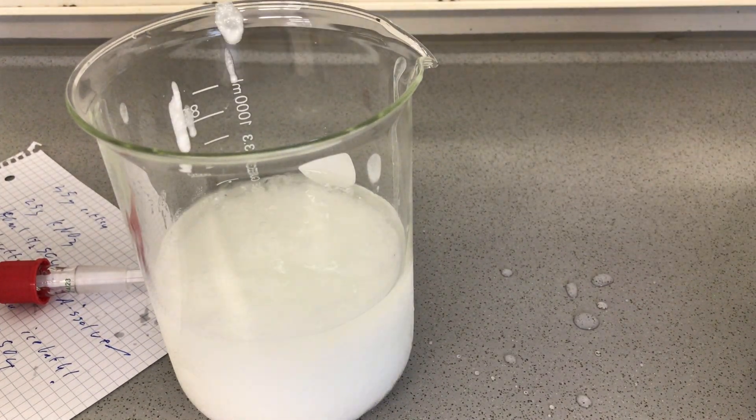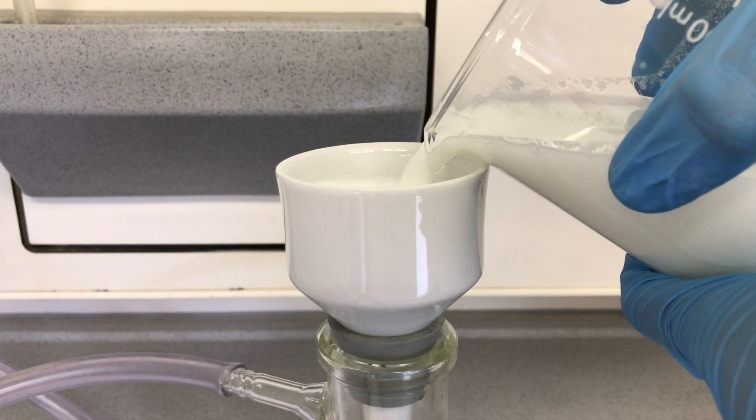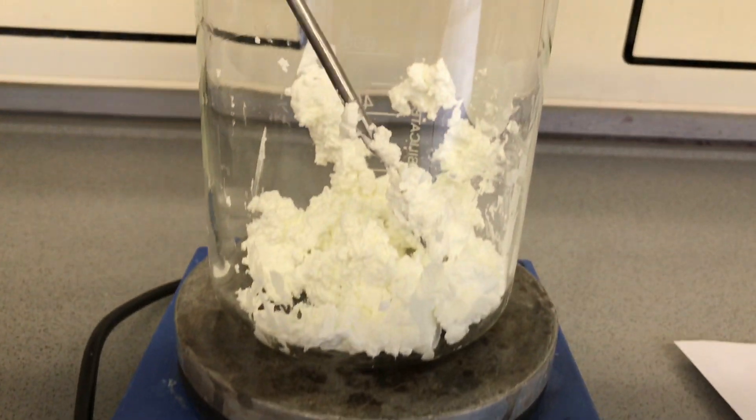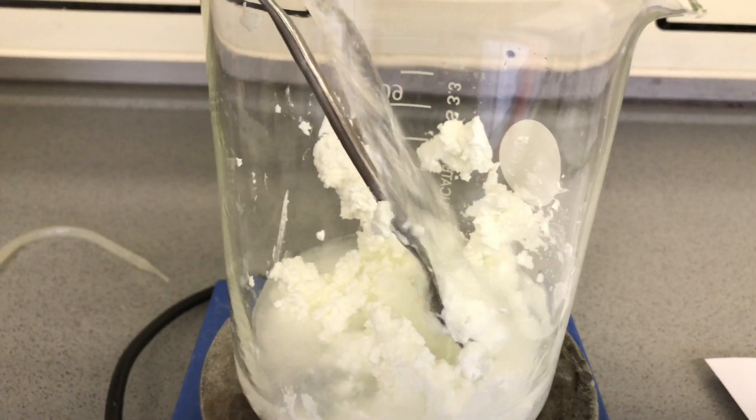A vacuum filtration was performed to get rid of most of the water and also to get rid of the acid. The filter cake was washed several times using distilled water to get rid of as much of the acid as possible. In the end we were left with this — it looks pure but it certainly isn't.